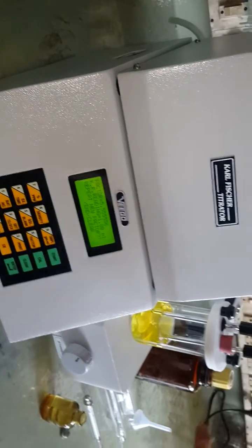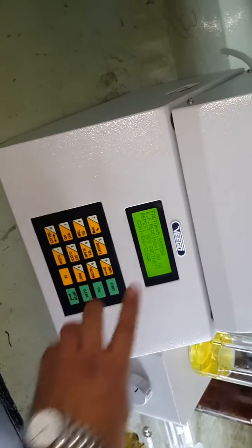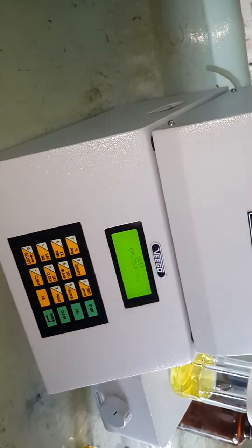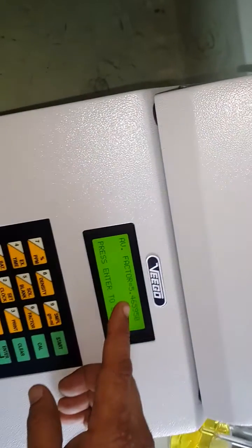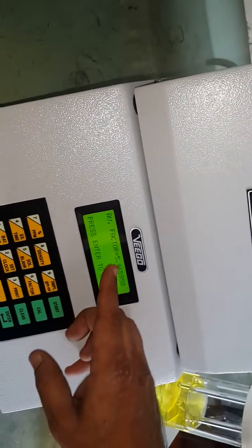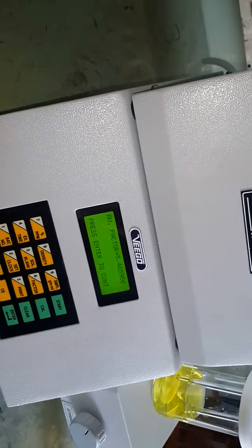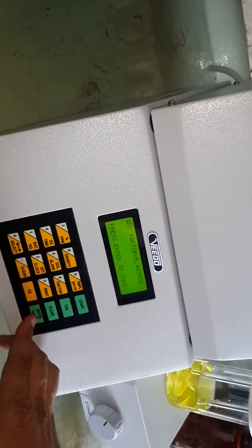When you are concluded with the readings, press the select key once so that the end option starts blinking. When end blinks, press enter. It will calculate the average factor of all readings taken. The average reading is 5.4659, meaning 1 ml of reagent is equivalent to 5.465 mg of water. This is the factor of the Carl Fischer reagent. We have now completed the second stage.